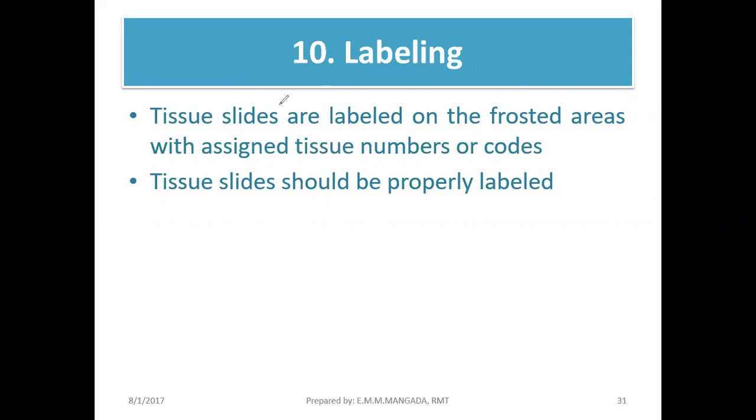Again, the last step is labeling. So guys, if this is your tissue slide, we have here the tissue. We usually use a slide that has a frosted end, so we just simply label this. During the process, pag nag-staining ka pa lang, nagki-clearing ka pa lang, please label your slide using a lead pencil. Do not use your felt tip pen or marker, kasi 'di ba in the process gumagamit kayo ng xylene, alcohol, mabubura 'yon.